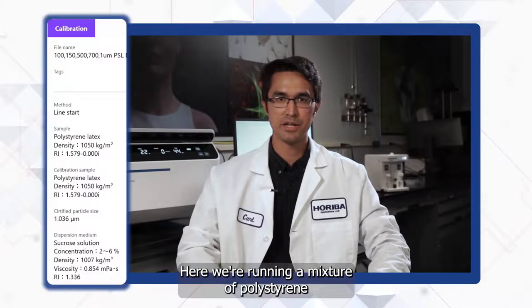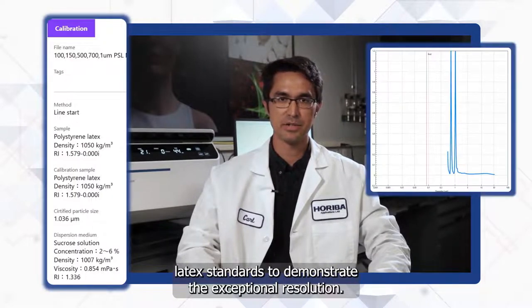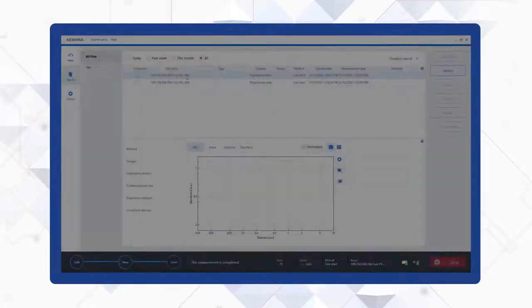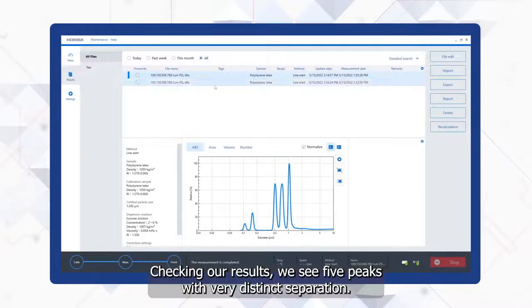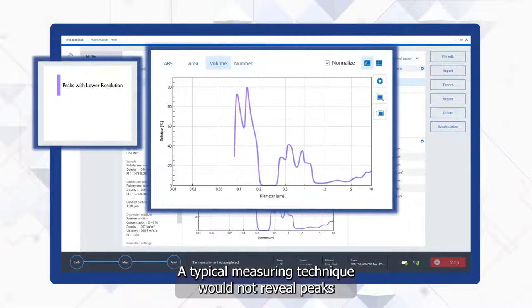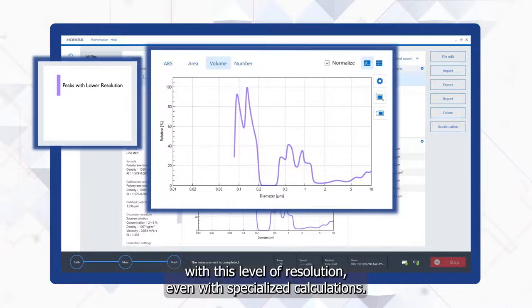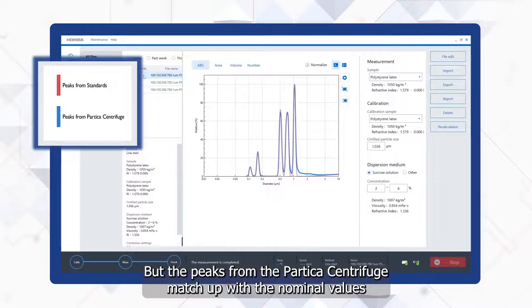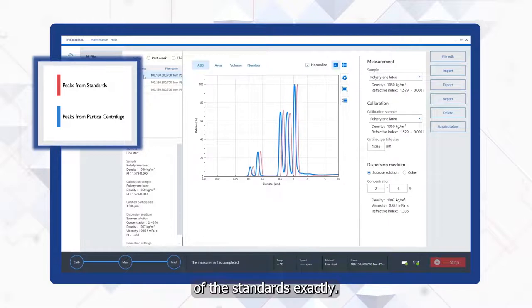Here we're running a mixture of polystyrene latex standards to demonstrate the exceptional resolution. We set up in Line Start Mode for this measurement. Checking our results, we see five peaks with very distinct separation. A typical measuring technique would not reveal peaks with this level of resolution, even with specialized calculations. But the peaks from the Partica Centrifuge match up with the nominal values of the standards exactly.